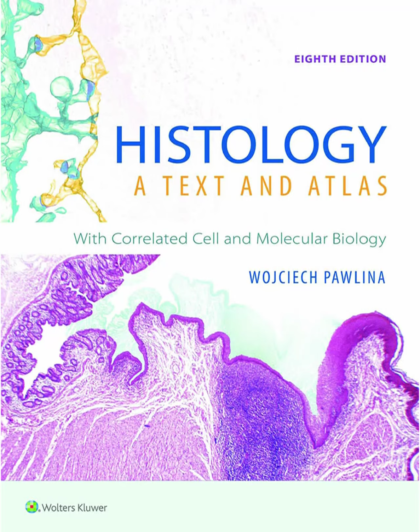Only the crisp, in-focus light gets through the pinhole to the detector. You scan a laser beam across the specimen point by point, plane by plane, collecting light only from that tiny focal spot each time. Then a computer reconstructs the image, slice by slice. It gives incredibly sharp optical sections, free from the haze you get in conventional fluorescence microscopy, allowing for detailed 3D reconstructions, like a CT scan for cells.